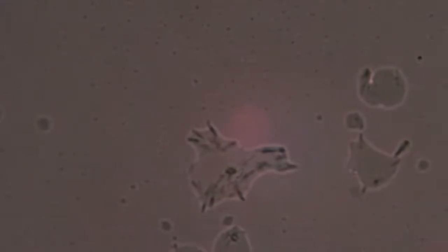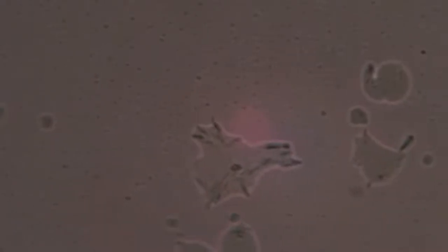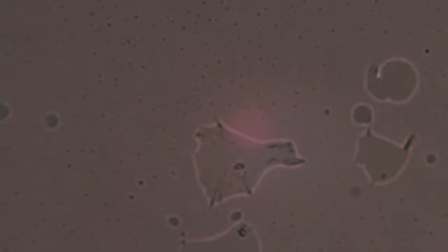So I didn't want to disclose what it was until I put it under the scope, but not to gross everybody out, this is some of the stuff I've been coughing up with my flu. So you're looking at, I believe, destroyed white blood cells clustering together. And I've got pockets of them all over the place. Few clusters in here to look at.